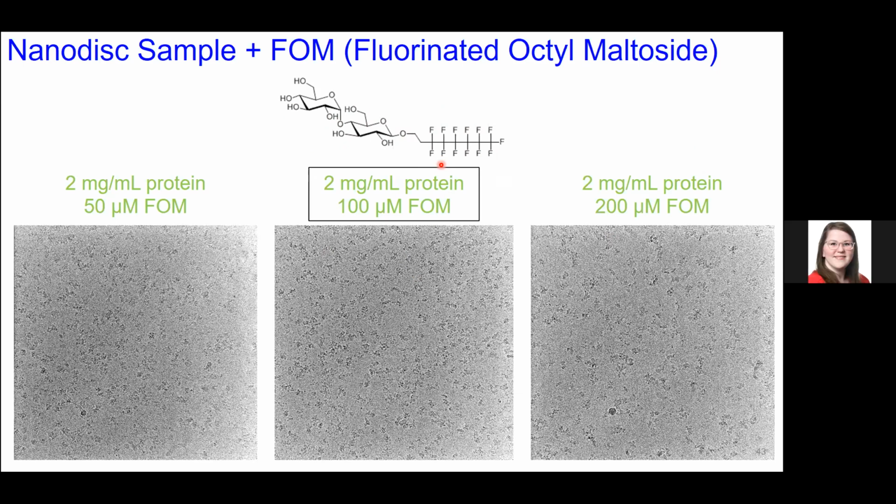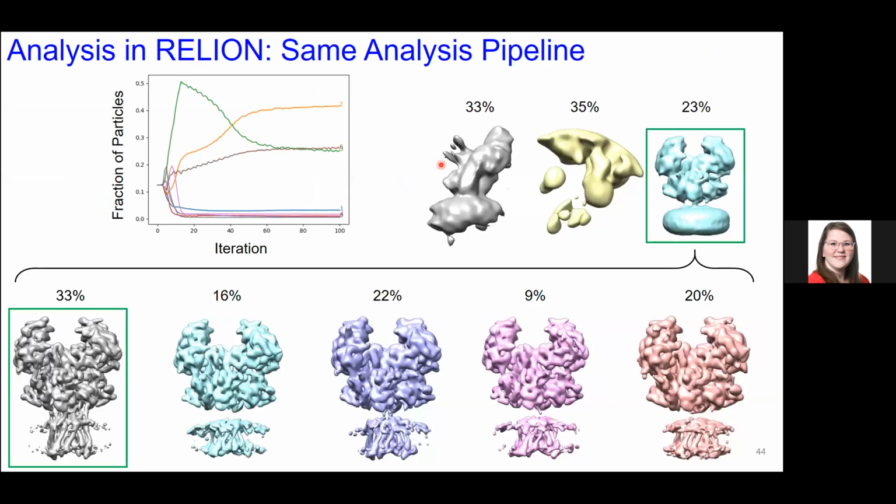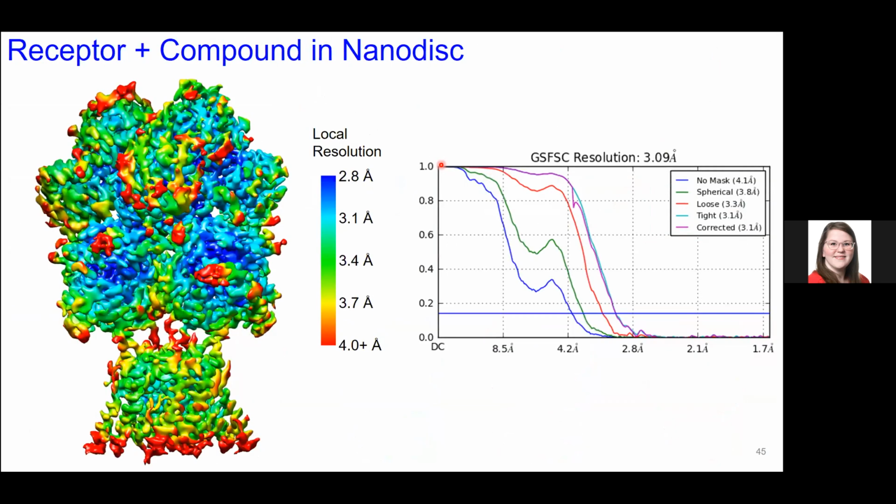The next question was, excellent work. For the 3.1 resolution map, did you see the zinc density? Why stage move, not beam shift move? Okay, so I think why stage move and not beam shift move was also answered above, which is that for these higher collection rates, we have to do beam shift and image shift. So that is actually what we did to increase our data collection rate.